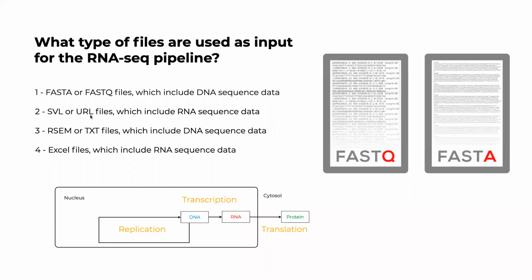Now, another thing to remember is that when we are sequencing, let's say we're looking for RNA, then we are trying to interpret what is in our data as a result. And so there are going to be several types of interpretation approaches. One is you can obviously just convert it to a common gene name from Ensemble ID.